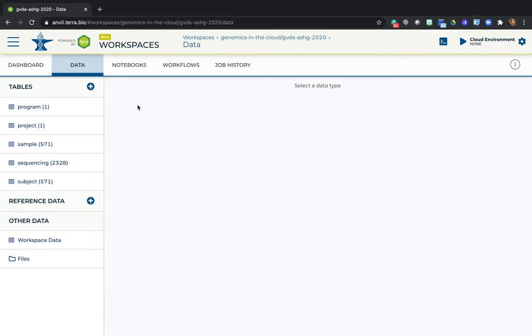Hi! In this tutorial, I'm going to show you how to find an analysis workflow of interest in Dockstore and how to import it into the Terra workspace where you previously imported 1000 Genomes data from Gen3 in the first tutorial.